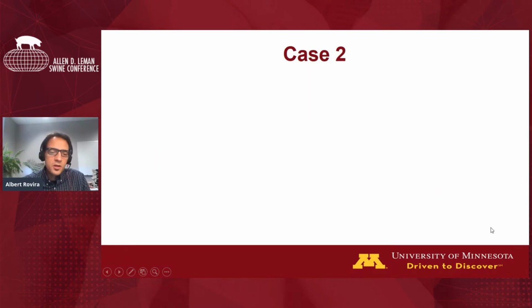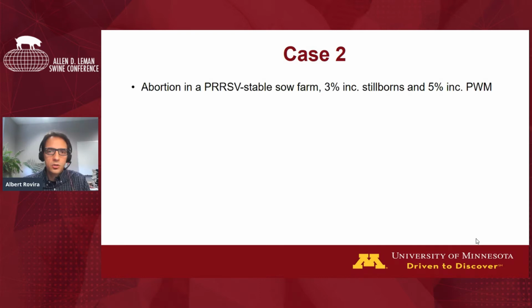So that was a first case, a case in which whole genome sequencing clearly gave us an answer to the question that we have. And that's why I wanted to show it. And it also had the recombination component to it. So a very clear case. Not all the cases are going to be like this. Not all the cases are going to be so straightforward or so revealing. So we're going to see a couple more cases that are going to highlight other situations.